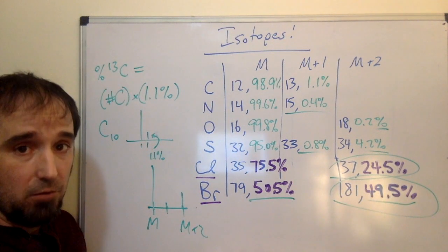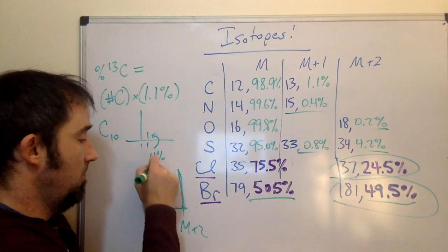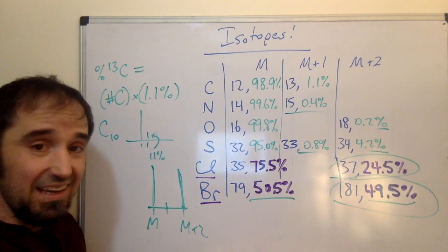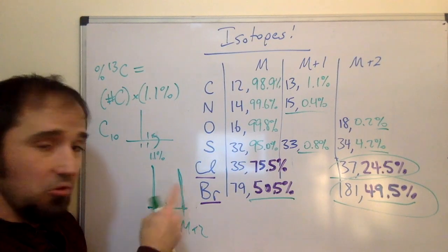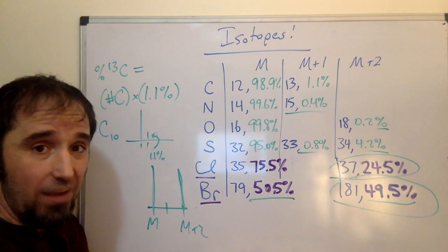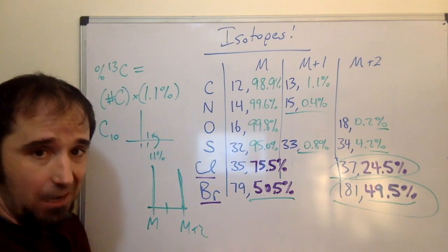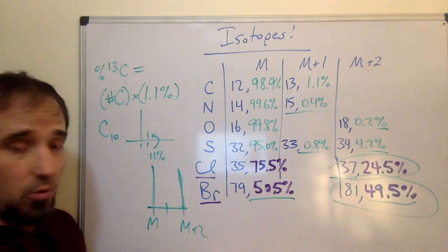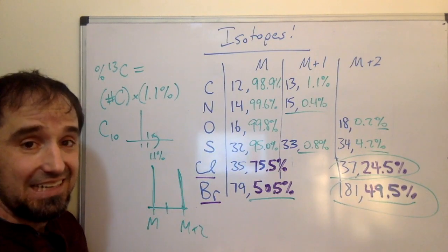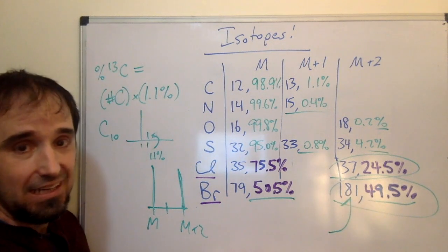Right? So now I'm looking for a pair of peaks that happen to be 2 away. Right? Bromine peaks will look like that. Again, is there something that I can lose that weighs 2? No, nothing in chemistry weighs 2. No atom weighs 2, right? And I can't lose 2 hydrogens at once like that. And so when I see peaks 2 apart like this that are the same height, that is a dead giveaway that I've got 1 bromine in the molecule.